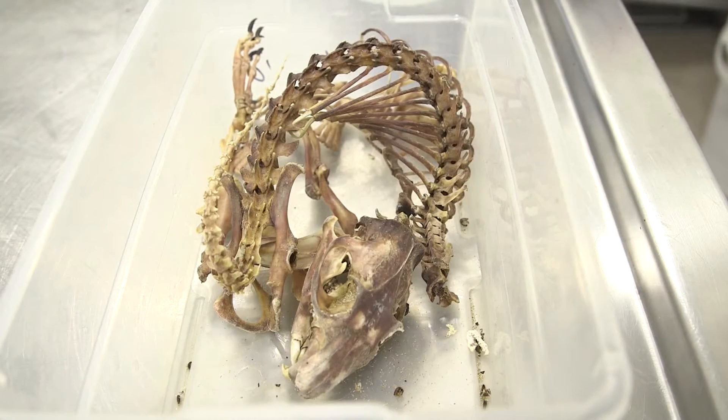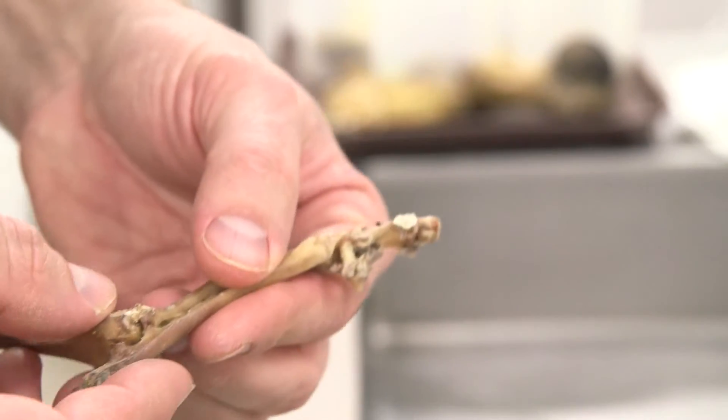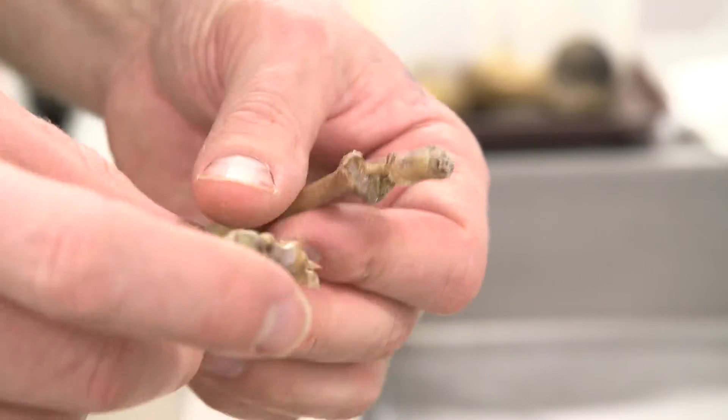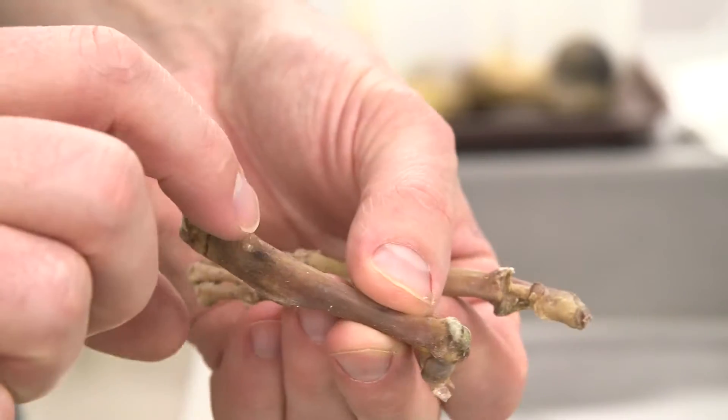Once cleaned by the beetles, the skeleton can be disassembled. The joints remain intact sometimes, but all the bones become accessible to measurements by researchers interested in skeletal morphology.